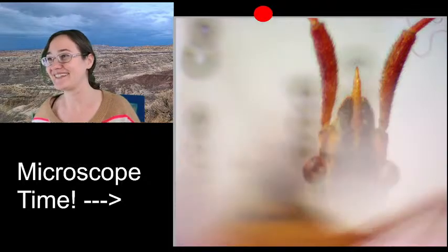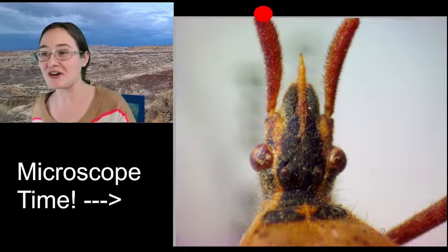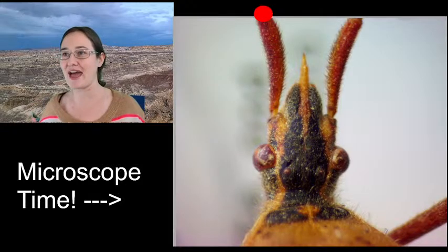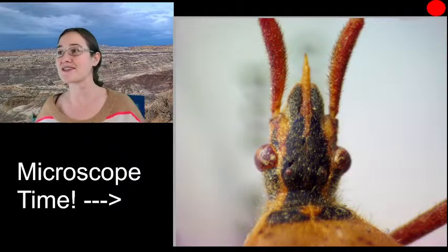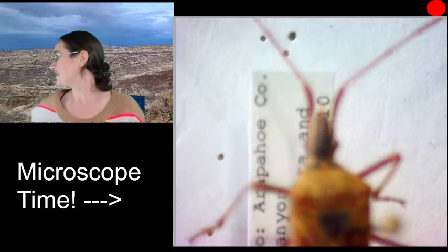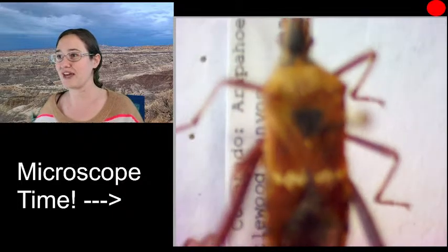Cool. Yeah, so as many of you already know that have been hanging out with me, I like to start at the front, I like to start at the head, and then work my way backwards as I'm sketching. I know that many of us like to have scale bars or have an idea as to the size of our insect almost even before we start. So what I'm going to do is zoom all the way out and hopefully get you a little bit of a scale bar. If he'll fit under the microscope, hopefully he'll fit.